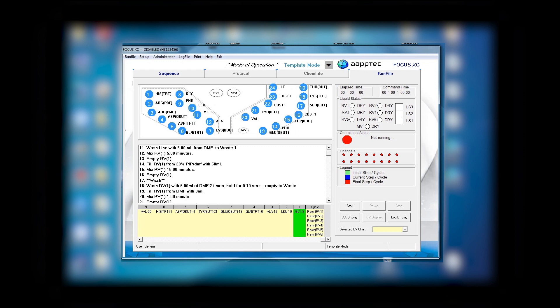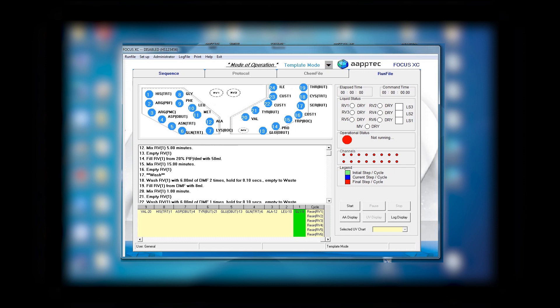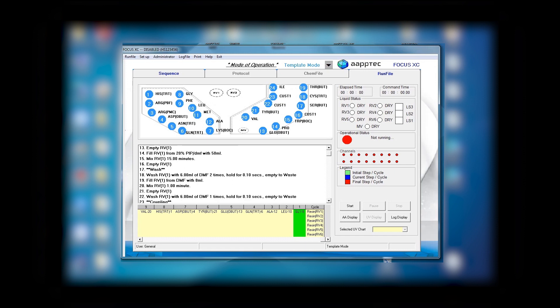You can wash this as many times as you wish and repeat it as many times as you would like. If you are going to wash the resin like a chromatography wash, rather than wash it multiple times, wash it with 16 milliliter or 20 milliliter at 0.1 one time.